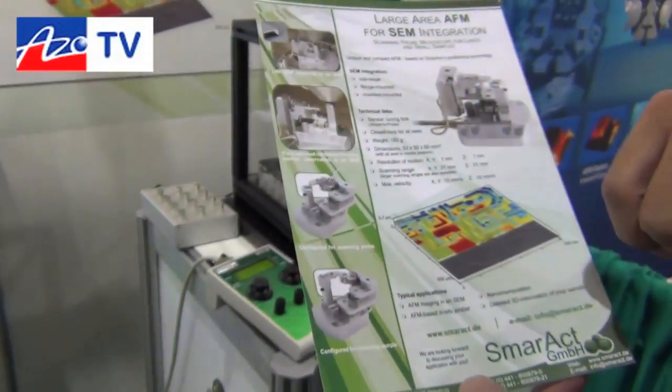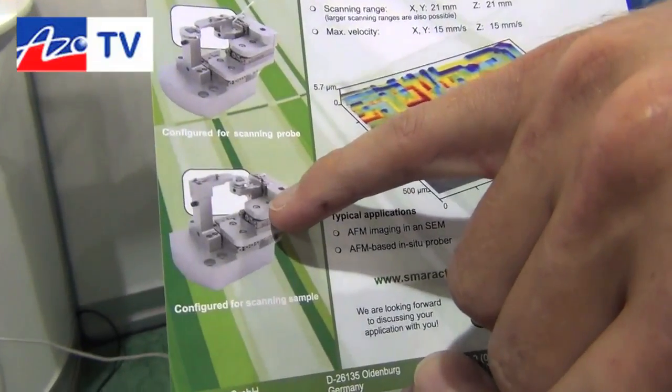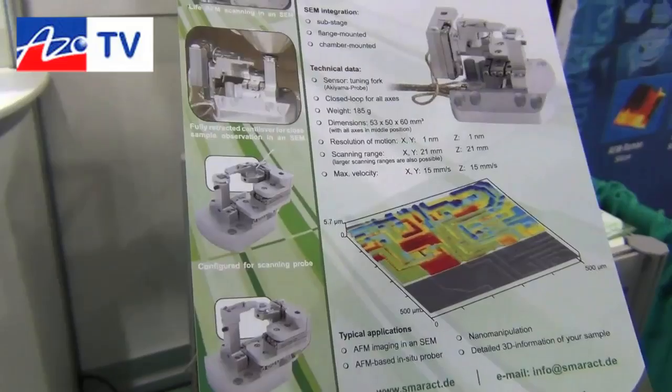Also interesting is that we have the possibility to do either sample scanning — where the sample is being moved — or probe scanning, where the needle itself is scanned over the surface.